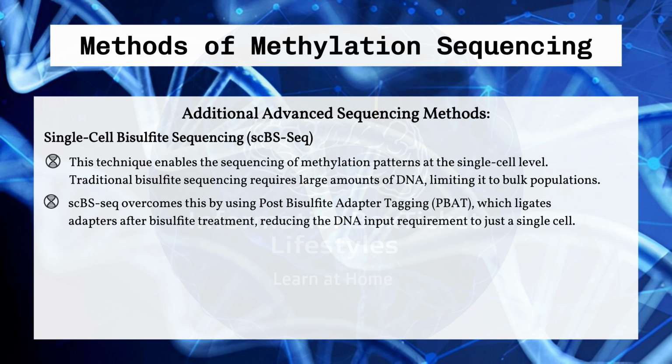SCBS-SEQ overcomes this by using post-bisulfite adapter tagging, PBAT, which ligates adapters after bisulfite treatment, reducing the DNA input requirement to just a single cell.